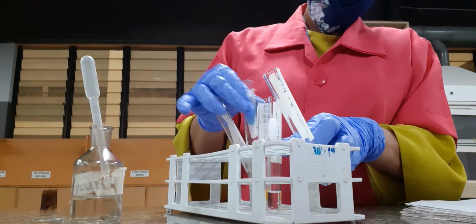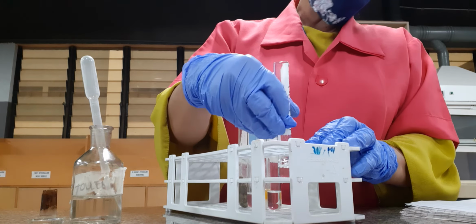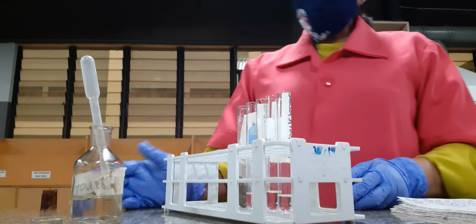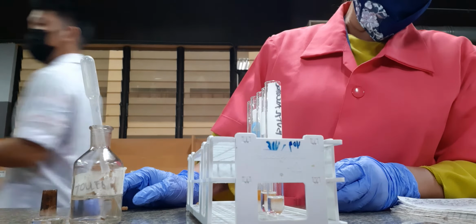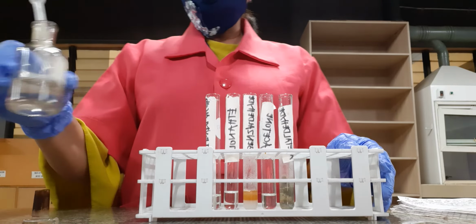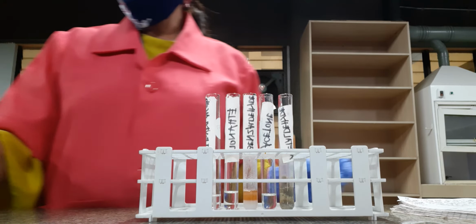So once again, what will be expected from this test? So the Tollens test is again a test for the reducing property of aldehydes. So therefore, we expect that we have aldehydes here that will generate a silver mirror observation, of metallic silver deposited along the sides of the test tube.